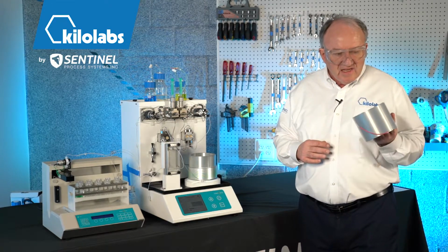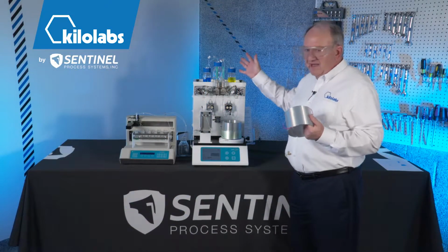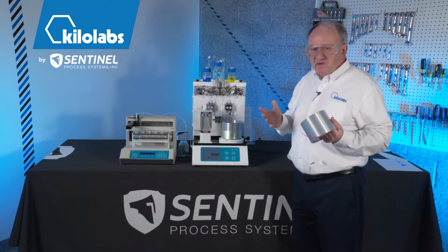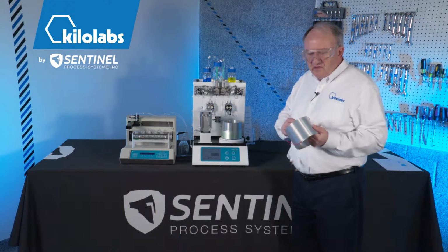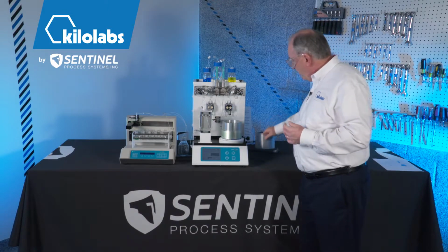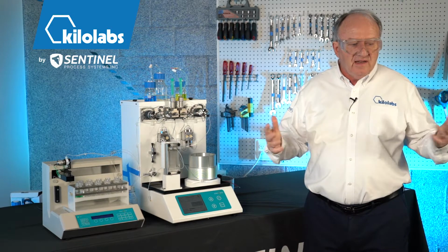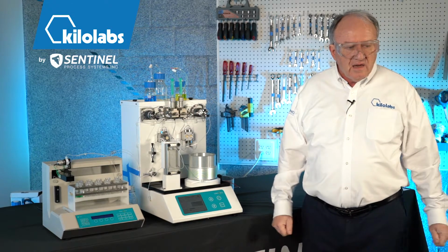But we recommend just getting the PFA coil and setting up this demonstration with food dye and IPA, just to get a sense of how the system operates, so that you know how the parameters are interacting with each other. It'll take you not more than a day, half a day, to do that. It's not a waste of time. It helps you get a sense of how it's all configured.